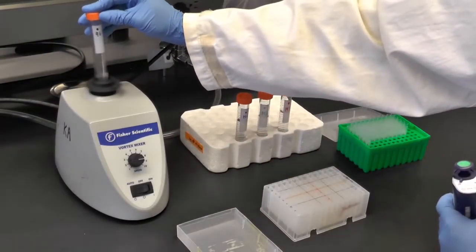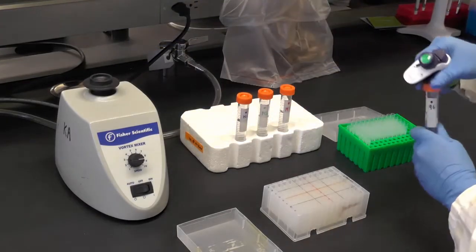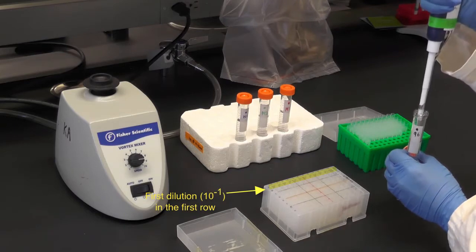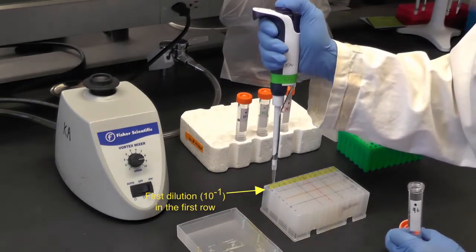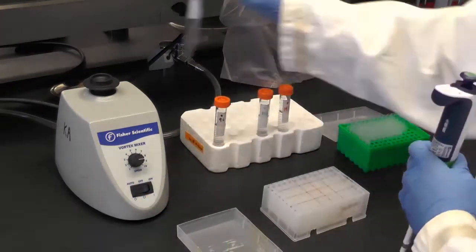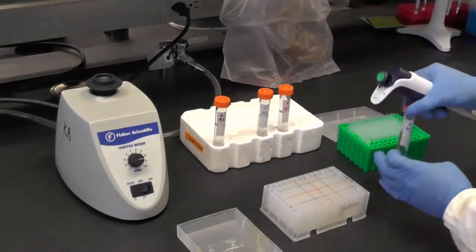Next, use a single channel pipette to transfer the amount of each sample needed to make the first dilution into corresponding wells in the first row. Remember to change pipette tips between samples. You can label the rows with tape to help you remember where each sample should go.